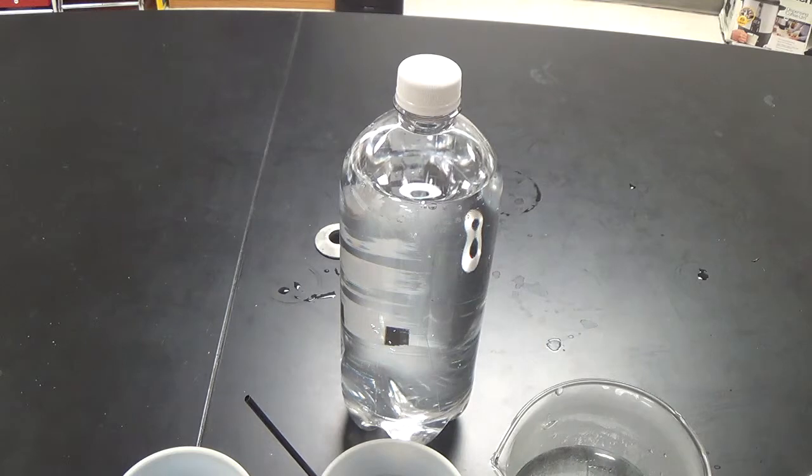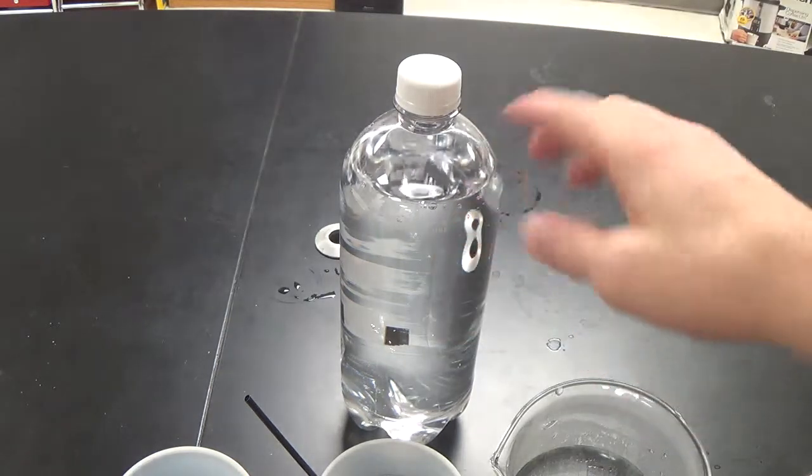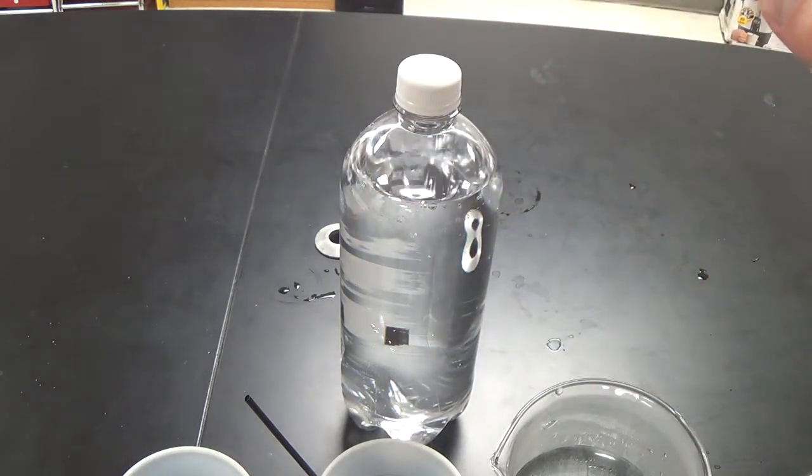With this part of the lab, we're going to look at dissolving a gas in a liquid. Specifically, we're going to look at carbon dioxide in water. Now, we don't have the equipment to actually look at dissolving a gas in water. That's a really hard thing to do. Gases don't want to be dissolved. They seem to take every opportunity possible to undissolve. So that's what we're actually going to do in this lab. We're going to look at undissolving the carbon dioxide gas from this bottle of soda water here.